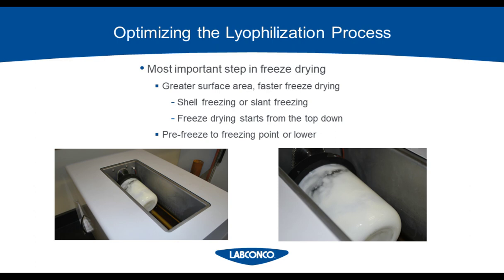The pre-freeze step is the most important step in freeze drying. You don't want to end up with a sample that will melt immediately on your freeze dryer because you did not freeze dry correctly or long enough. The greater surface area, the better when freeze drying your samples.